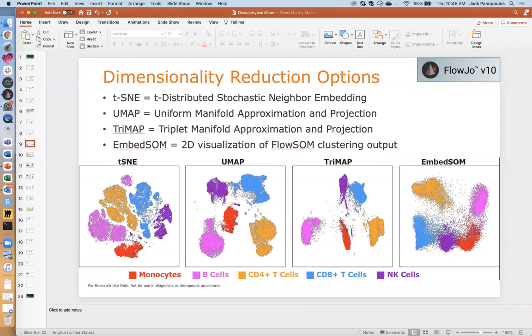Okay, and same thing when you look at the NK cell population, which is in purple. Looks like there's at least 2 here, plus 1 over here, and another one over here. Whereas in the UMAP, you've got a couple of pops here, another one here, and then of course the globular cluster.